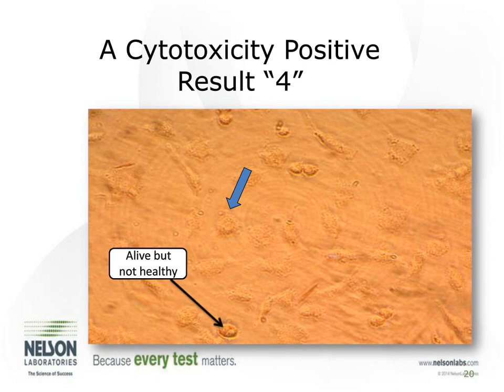So this is the cytotox test. We expose the cells to your extract, and we visually assess how toxic the cells responded to your sample, and then based off that percentage, we give you the score of pass or fail. Like I said, very cheap, very quick, and very sensitive, so it's a very good screening test. Now, for the next two tests, we're going to be talking about the irritation and sensitization of the big three.